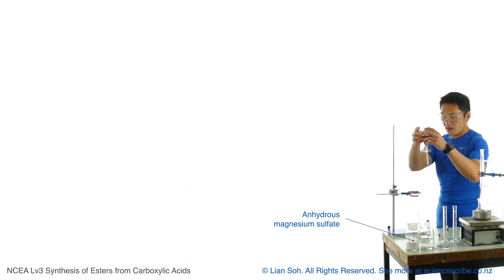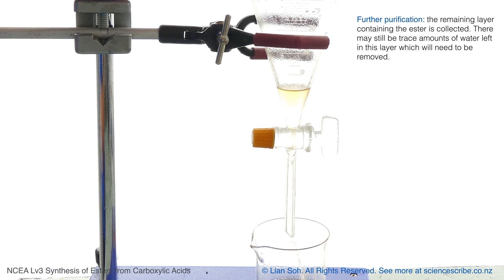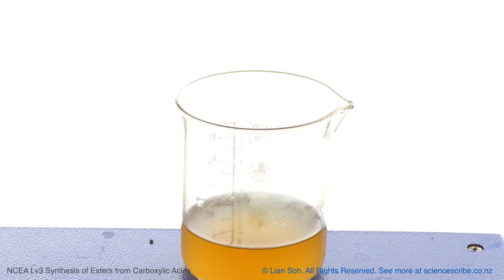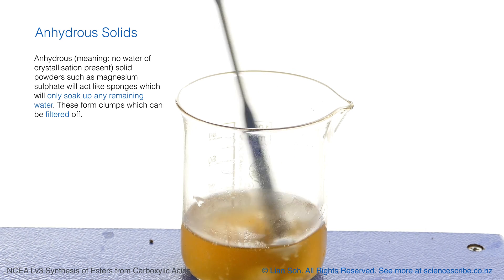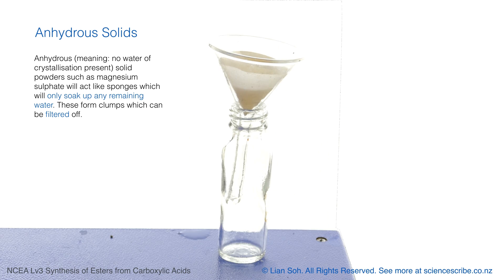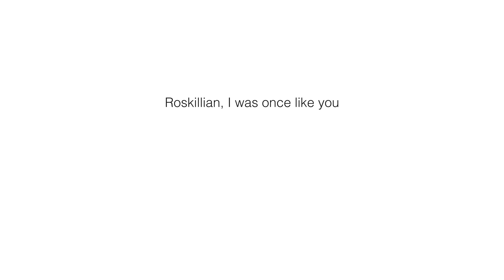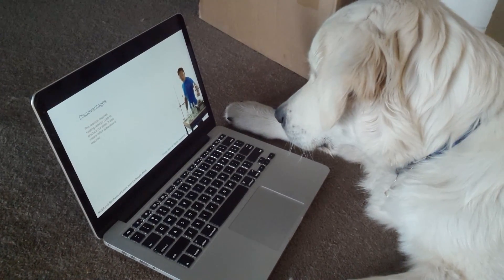Everything left in this separating funnel should be the ester that I want. If I'm worried there might still be a small amount of water, I can add some anhydrous magnesium sulfate. The key word is anhydrous — that means it's completely dry — and the goal is to soak up any additional water that might be left. Then all I have to do is use a bit of filter paper and a funnel to extract my ester and filter off the solid, making sure what I've got is indeed the ester.